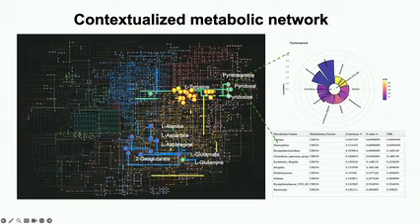So overall, we leverage the knowledge about their known metabolic capacity, together with what we detected with metabolites, to help you see whether there's a link and what the hypothesis is. If you're able to culture these particular microbes and validate it, then that's your high-profile paper.